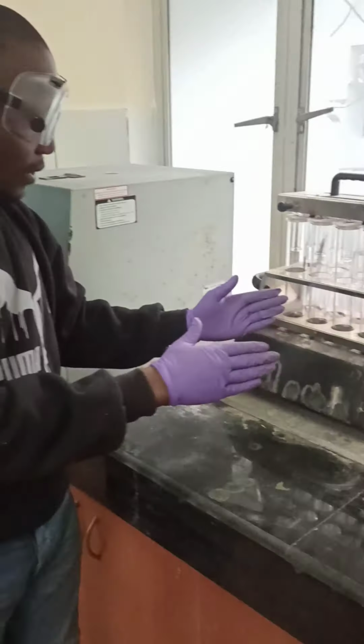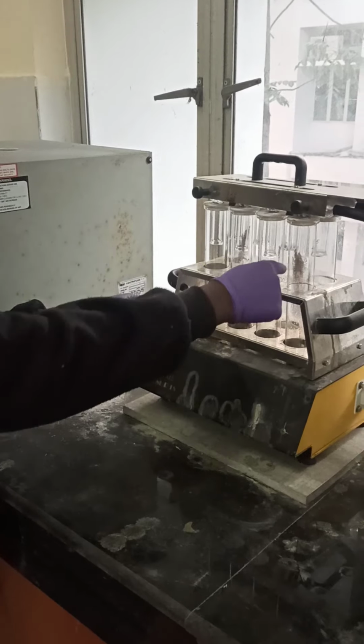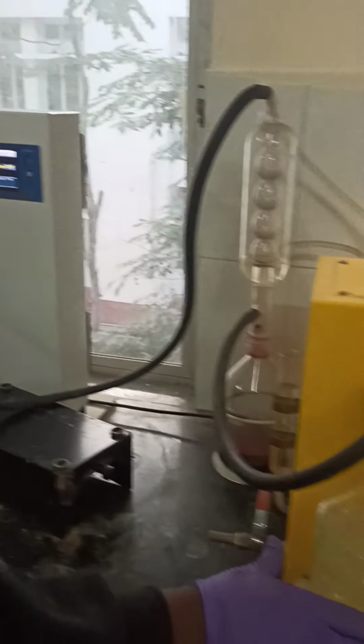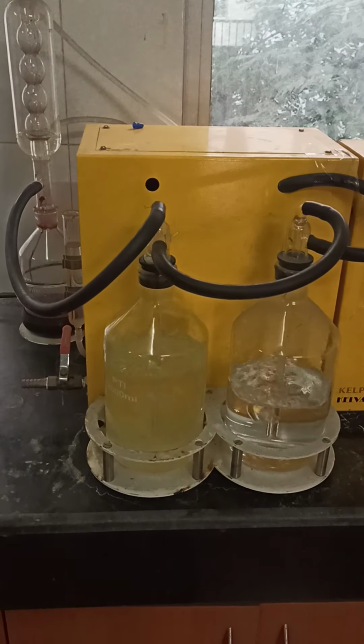And today, I am doing this, the so-called digestion. Here, these are the samples. Sample 1, 2, 3, 4, up to sample 8. We already have set the system, it is running. As you can see, water pumping here. These are the absorbers. They are pumping strongly within the system.